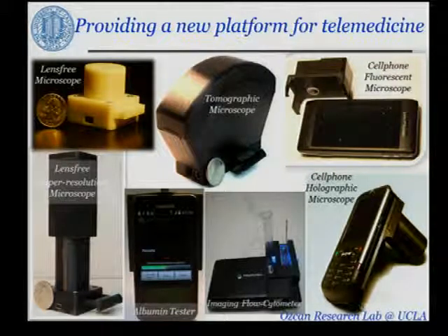I'm not sure if we can call some of these phones smart anymore, but still, with the recent generation of mobile phones, you can actually push this technology to the level where you can see individual viruses or individual DNA, a single DNA molecule that is labeled with a fluorescent tag. So it's come a long way thanks to a lot of these developments coming into play.